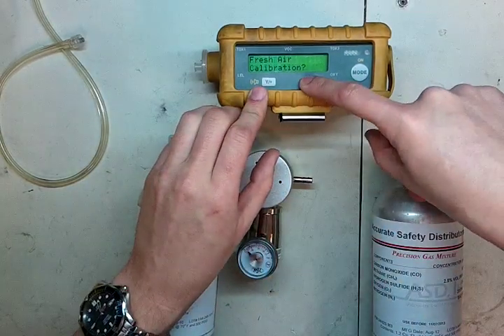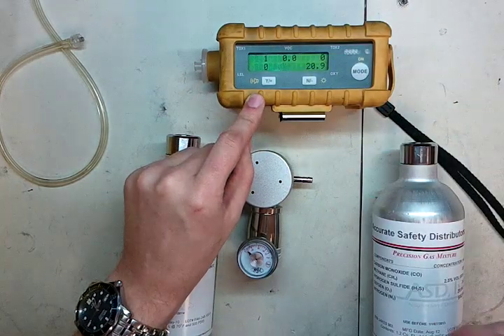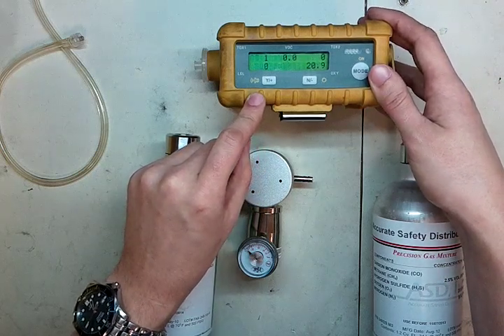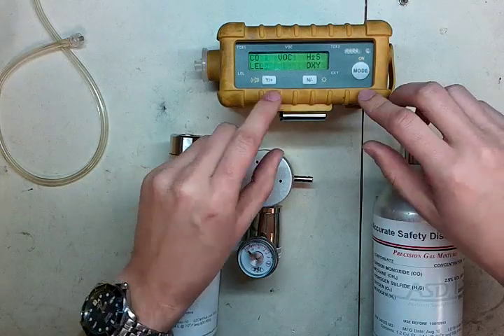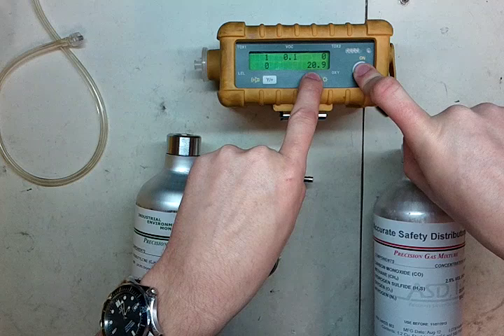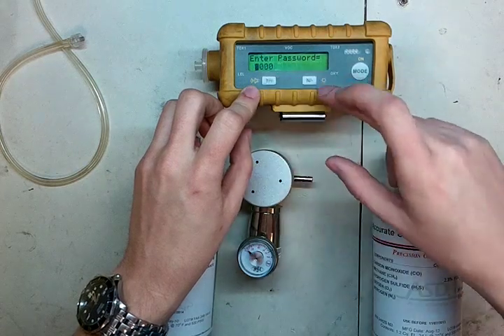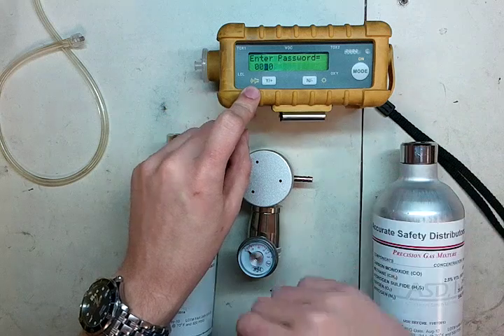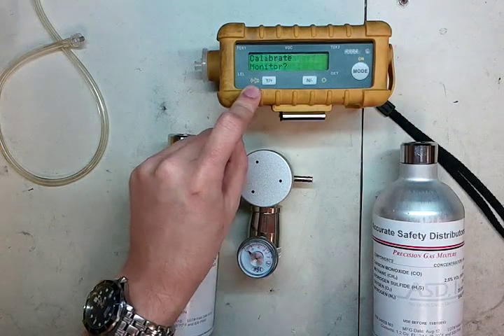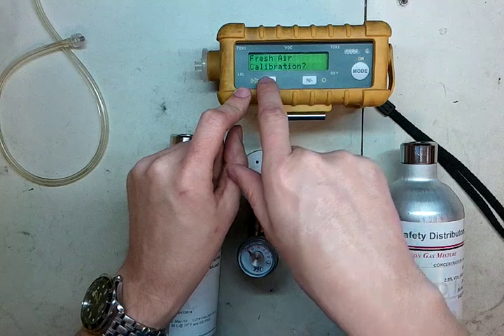Fresh air calibration — I'm going to say no to this right now so I can show you the full procedure. It's showing generally zeros across the board; we've got one on our CO. To calibrate it, press and hold the mode and no buttons at the same time. Release, and it says enter password. If you have a password, yes brings the number up, no brings it down, and mode advances you through it. If it's 0000 like almost all of them are, press and hold the mode button. It will pause the data logger and now you're in calibration mode. Click yes to enter the menu, then fresh air calibration — make sure you're in fresh air first — and click yes.